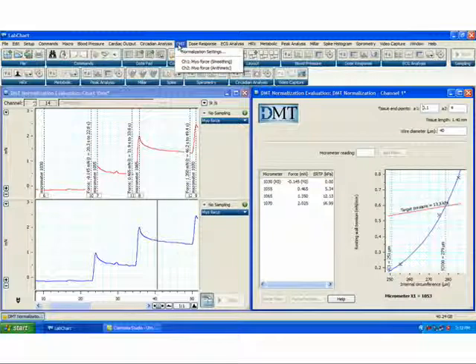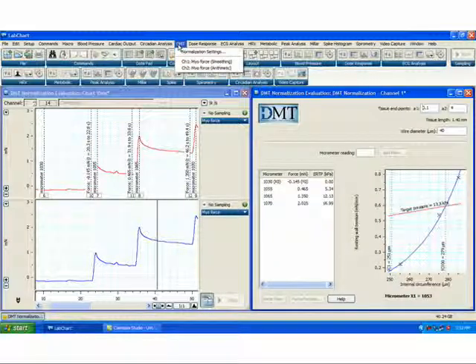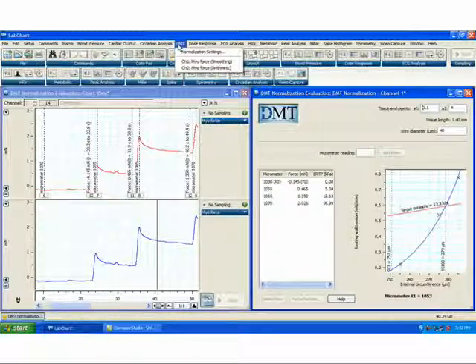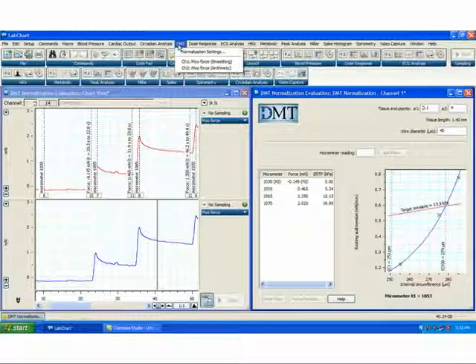The module calculates the micrometer setting at which the vessel will have a normalized internal circumference with suitable resting wall tension. This process is analogous to the pre-tensioning of rings in traditional tissue bath studies.